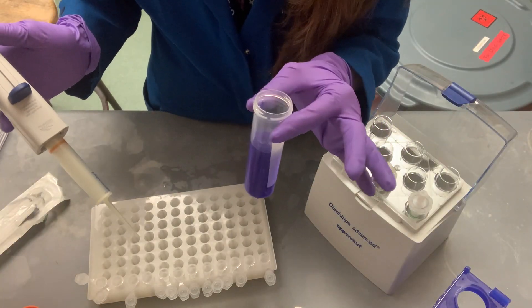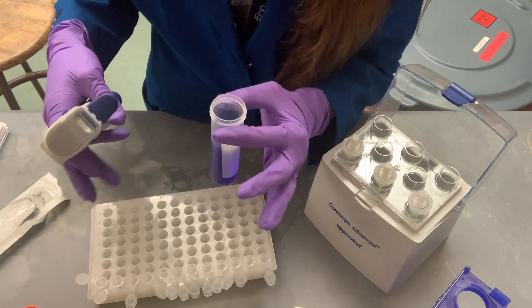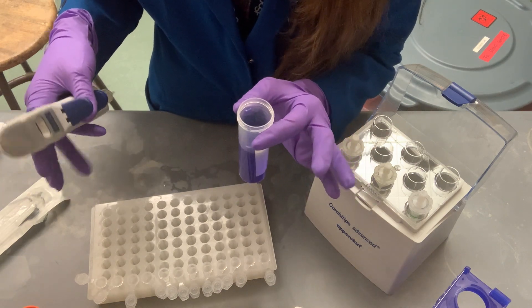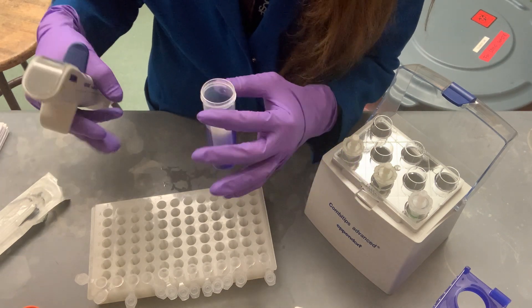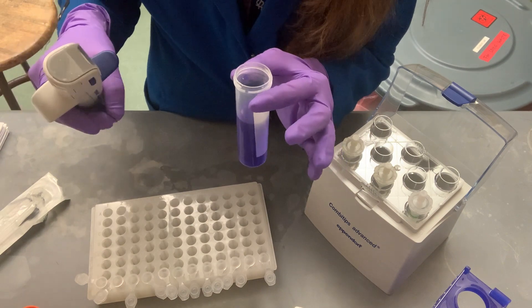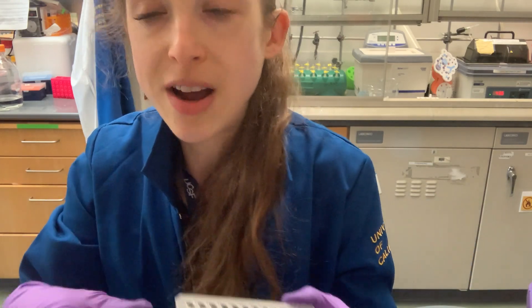I made the liquid blue just so you can see it, but it could be anything you want to aliquot. This could be loading dye for a gel, antibiotic stock solutions — aliquots are super helpful because they reduce freeze-thaw cycles and contamination of your original stock. Repeater pipettes also come in handy when setting up crystallography trays to add an additive across all conditions.